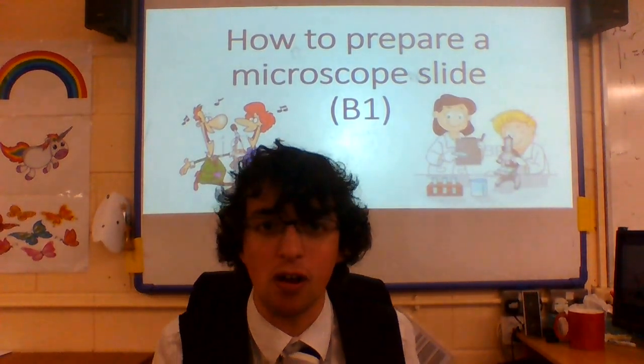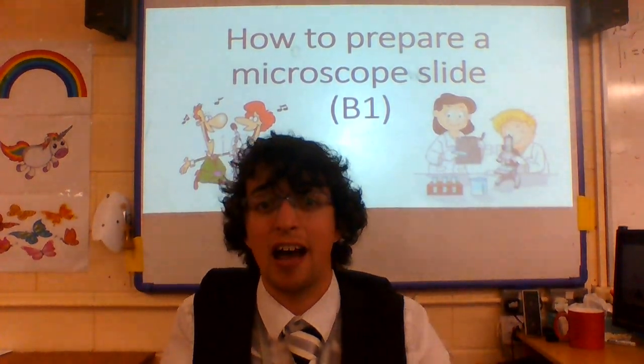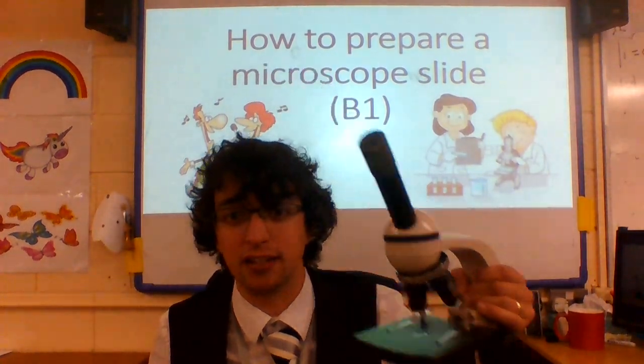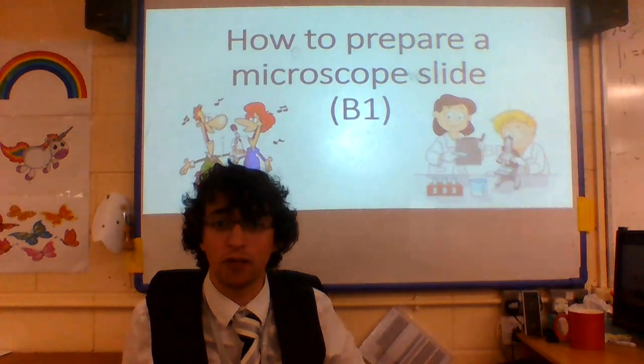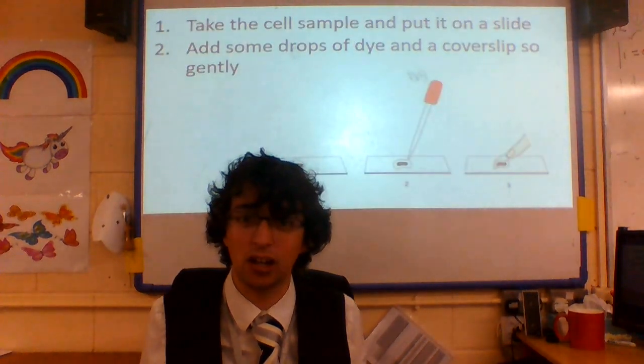Today's video: Biology B1 — how to prepare a microscope slide and then how to use one of these lovely things. We just need four steps to do this, ladies and gentlemen, but it's a really important practical for us to know. So let's have a look, going from the beginning.